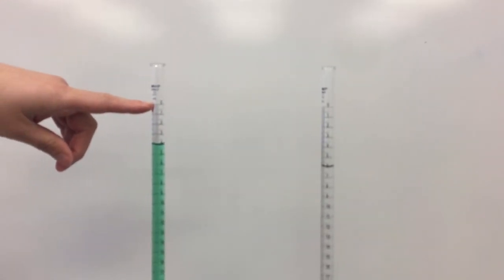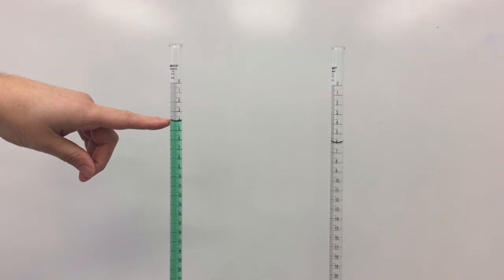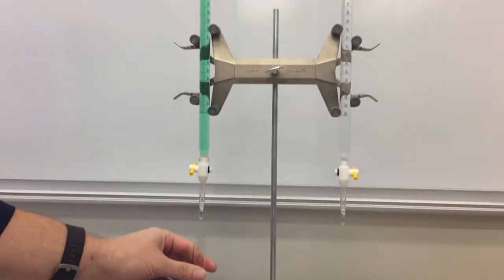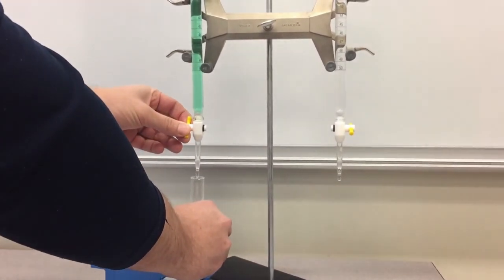Since we want to dilute 4 milliliters to 10 milliliters, first we're going to deliver about 4 milliliters from the burette into a test tube. At the end of the delivery, we'll take note of the final burette reading.